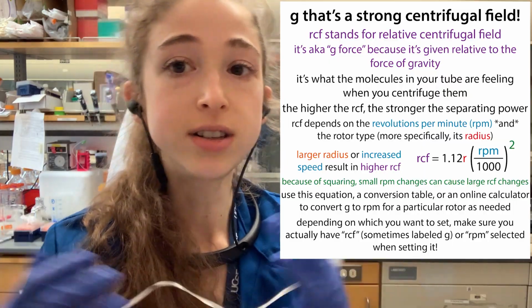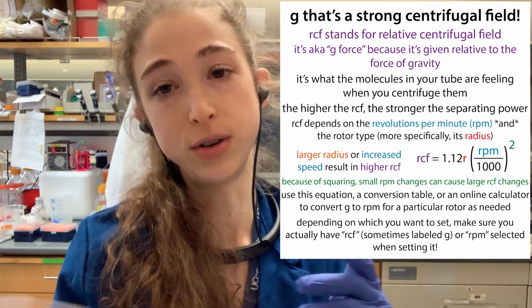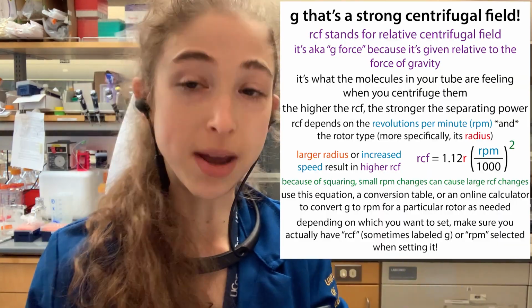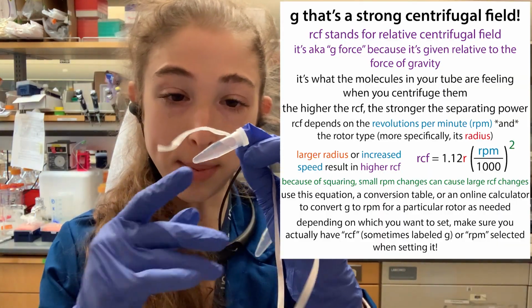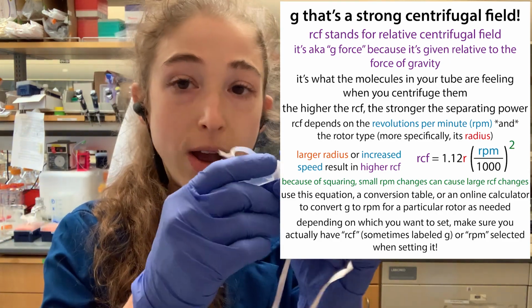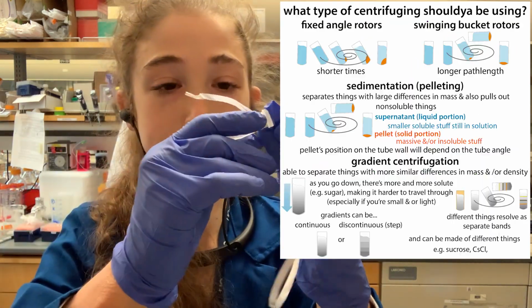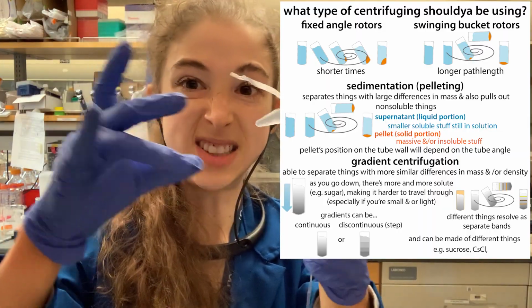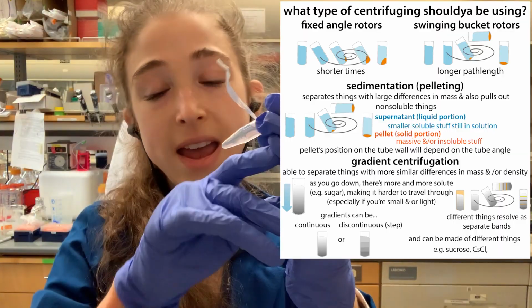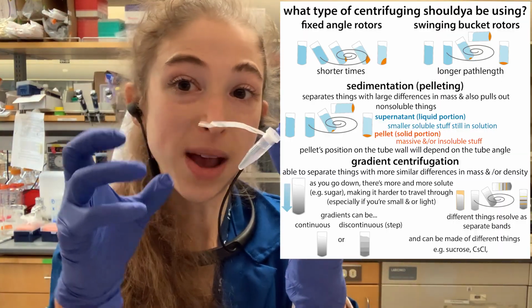So gravity G, sometimes we call this the G force, so you'll see it like times G. That's where that's coming from. And that's talking about the force that's going to be applied on the molecules in the tube. This force is going to help push the heavier and denser stuff. It's going to travel faster through, and therefore it can pellet out.